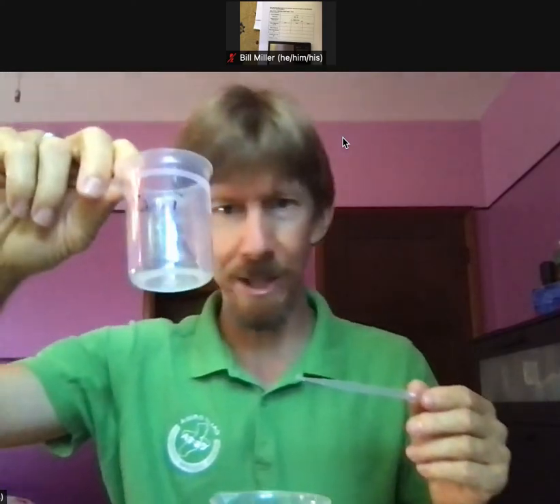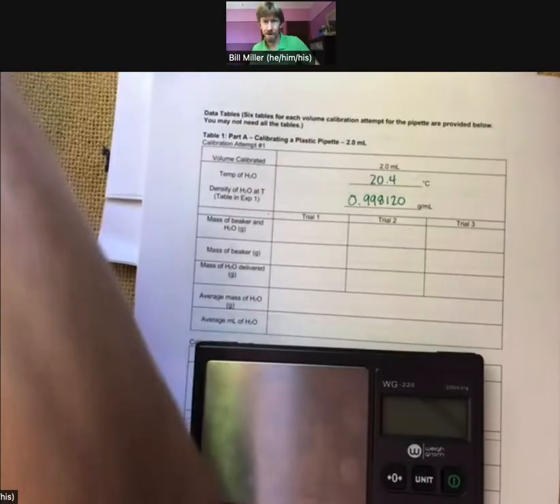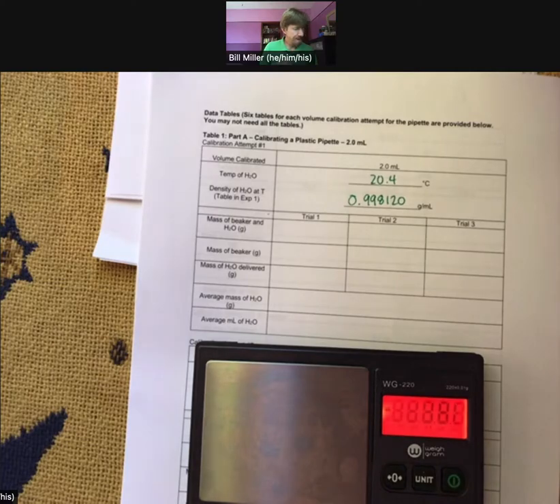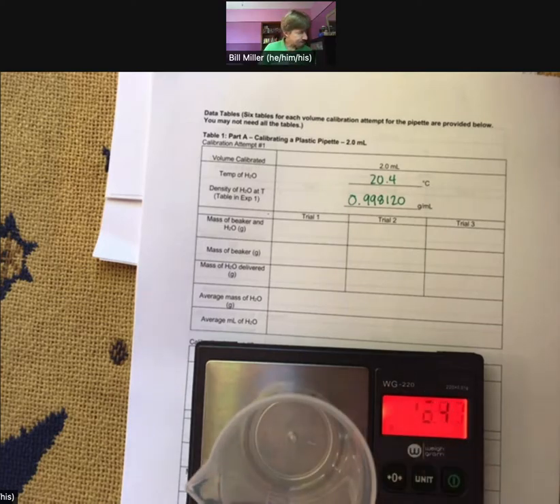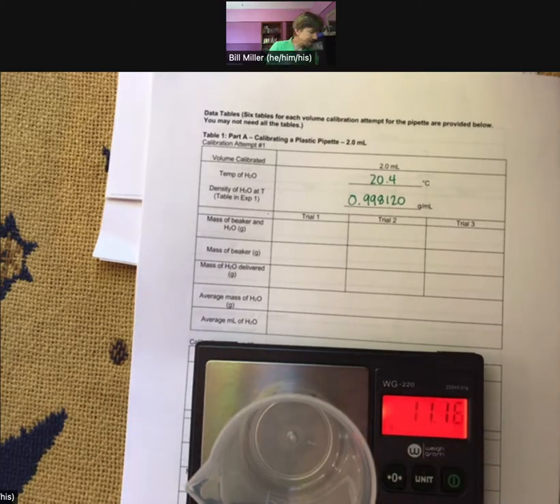Record the mass of a 100 mL beaker — a 50 mL beaker would work as well. I've turned on my scale, I wait for it to say zero, wait for the little circle to appear, and then I'll weigh it. That's 11.16 grams.